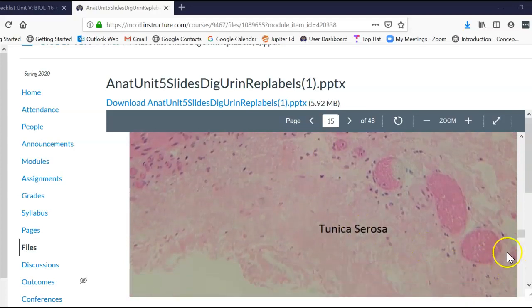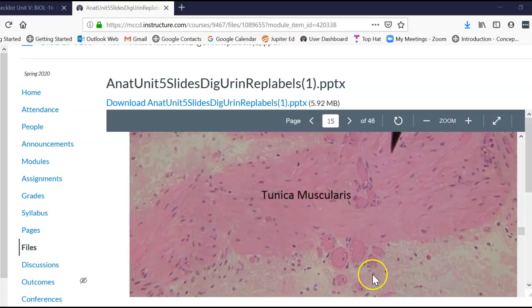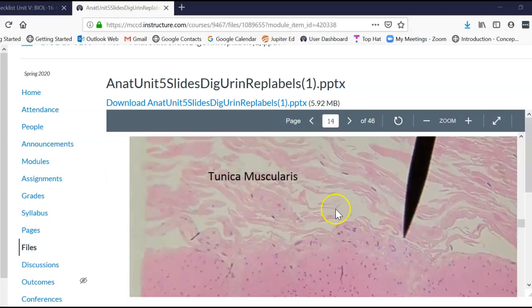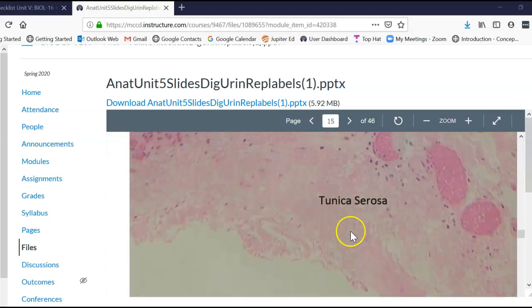And this is a blood vessel that goes in and out, waving, and we caught pieces of it as you can see it approaching, going up through this. Probably goes here and up here and into the serosa, but I don't know. I think we lost it. But anyway, that's the tunica serosa.